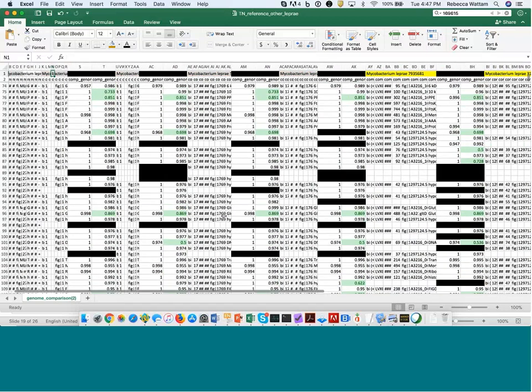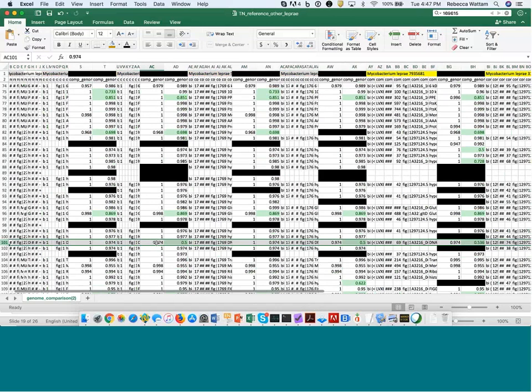So let's look, for example, at this gene here. I just picked it out. I don't know much about it. It has a 97% sequence identity, which you would think, that's really great. But then you see it's only got a 50% coverage. So paying attention to those kind of differences can be very important in helping you determine how good of a pair these genes are.